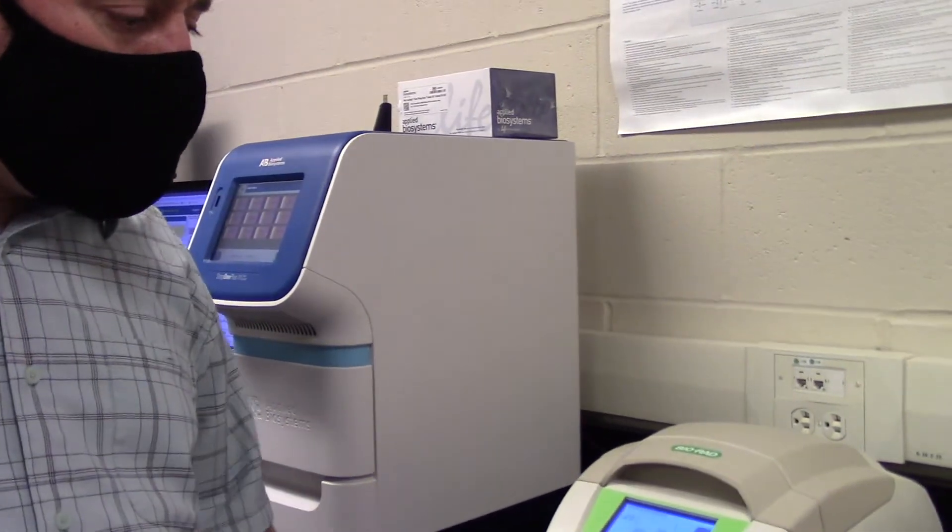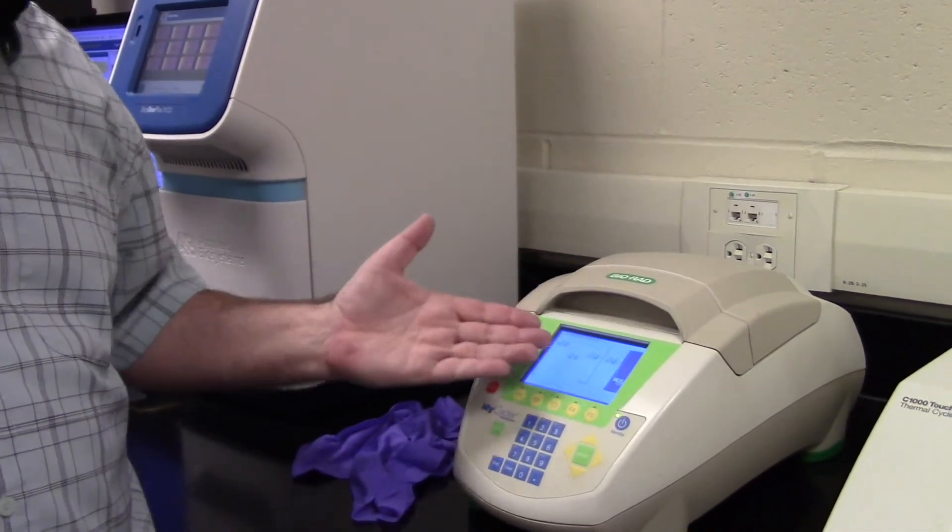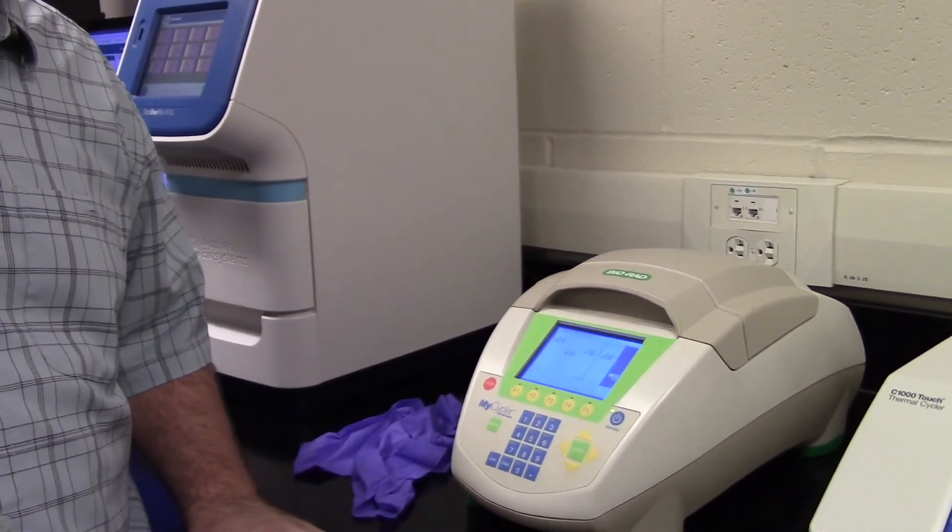So this is how we use a PCR machine. We put our tube in and let the machine do all these cycles. It usually takes about three hours to complete.